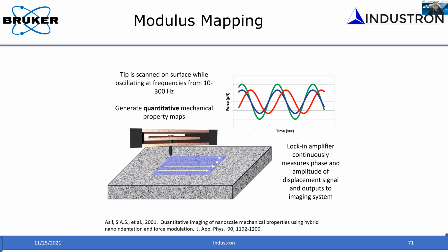And the displacement response is also less than nanometers. So these are very small signals, and you have to use a lock-in based detection technique. Normal detection techniques won't work. So that you need to keep in mind.